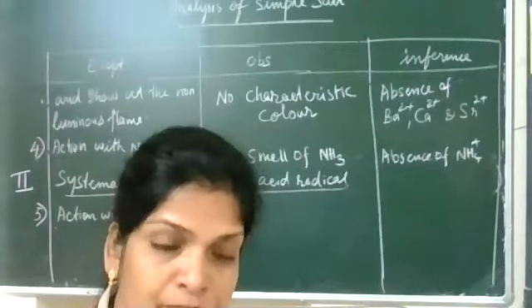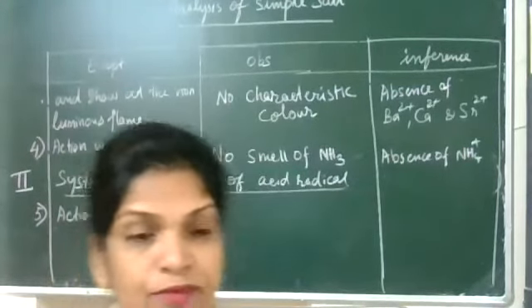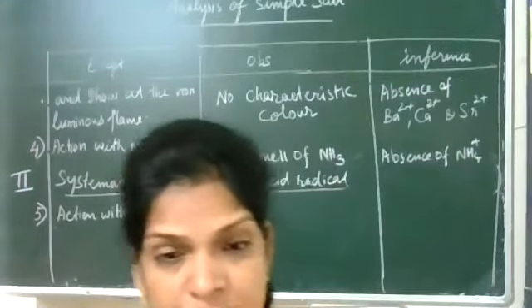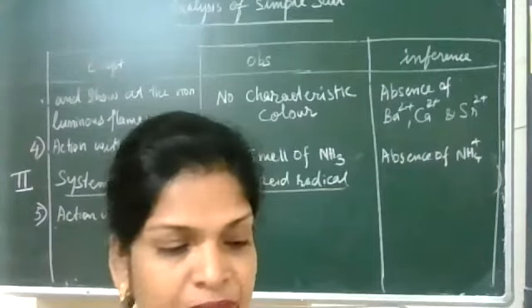The moment you add dilute H2SO4, you are expecting four different types. From that only one you may be getting, or nothing you may be getting.